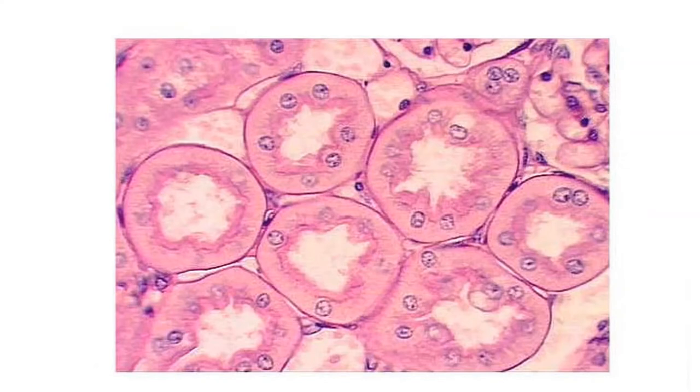What's here? Immediately, soda straws, right? No problem here. Single row of boxy cells, nice good lumen in the middle. This is simple cuboidal epithelium. Location, kidney tubules. Function, secretion and absorption.